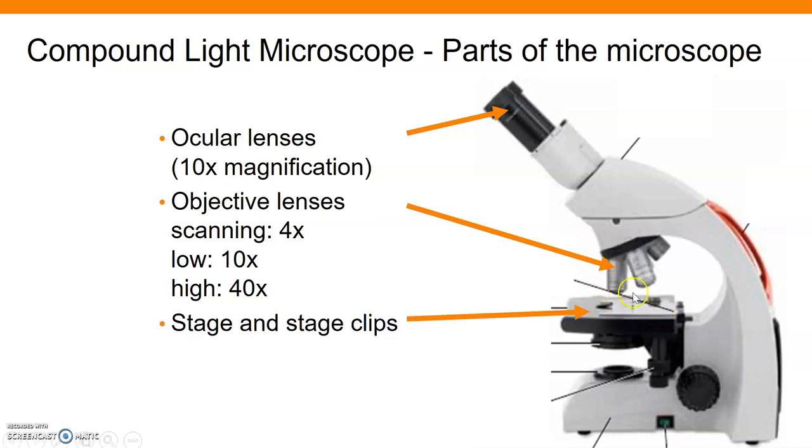The other thing here, this big flat black thing, is called the stage. The stage also has stage clips on it. These clips will hold the slide snugly on the stage. Note that when you do look at ours, the stage clips are going to be flush with the stage, which means they'll physically touch the stage. Your slide will sit between the stage clips. They will not sit under. You don't have to pick the stage clips up, which is common in some microscopes. It can actually ruin our microscopes if you start pulling those stage clips around. You're just going to slide the slide right in there and it's going to get hugged by the stage clips.